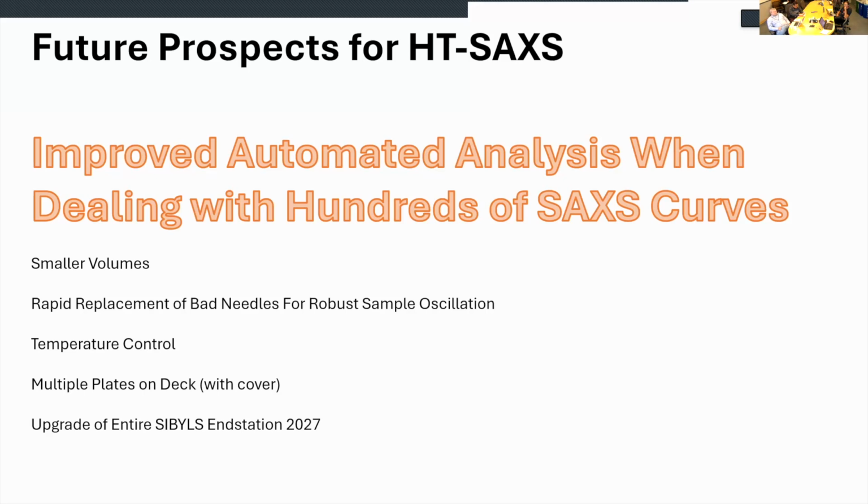Multiple plates on a deck with a cover, and then there's this whole upgrade thing, which we're going to do in 2027. I had a whole bunch of slides on each of these, but I will stop there and see if there are questions.